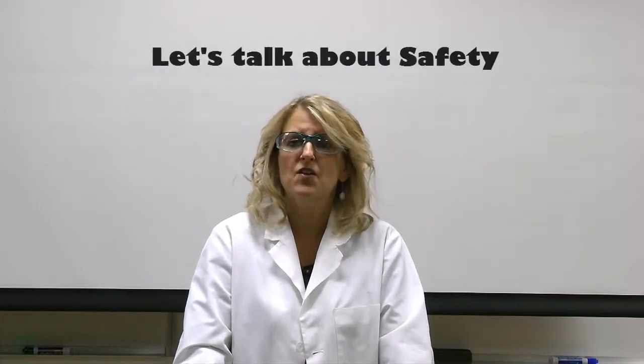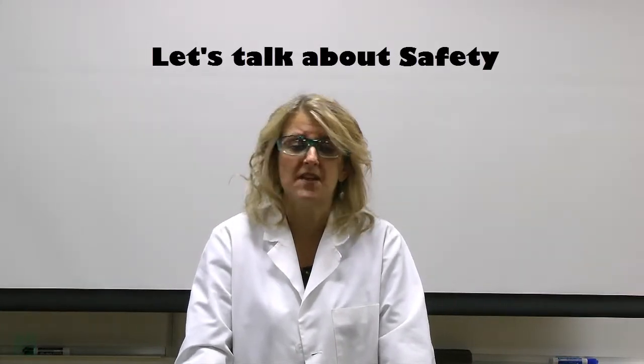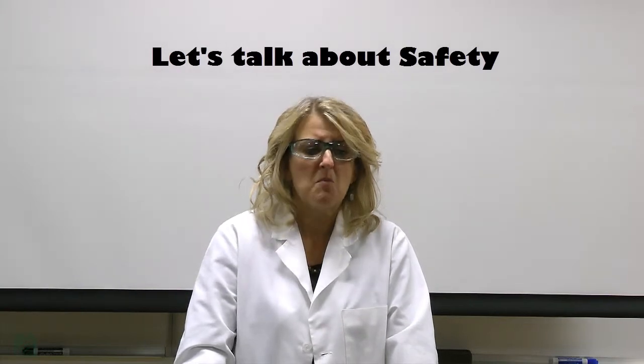Hello and welcome to Bio 113 Online. We are glad to have you. Before we go any further, we need to spend a few moments and discuss safety. Your eScience lab kit has been designed to be as safe as possible, but this is science and there are chemicals included in your kit, and precautions must be taken.